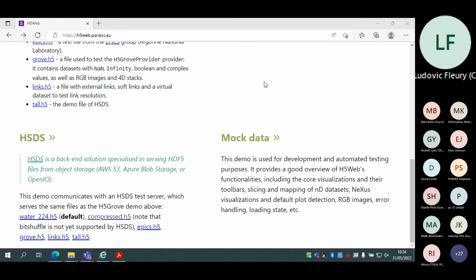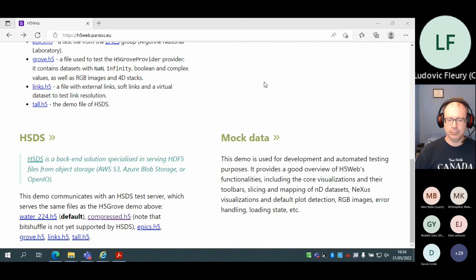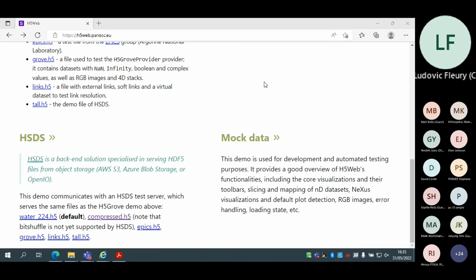So you have to add the layer on top. And this can be the same for the ontology. If we find that adding an ontology is a bit too complex for the viewer itself to deploy for everyone, then we can discuss making it a bit more flexible and deploying multiple packages for different ontologies, for example.